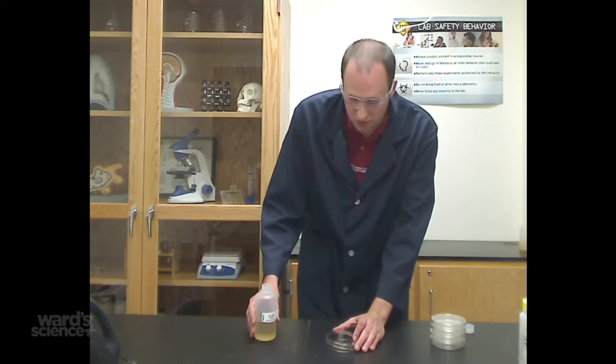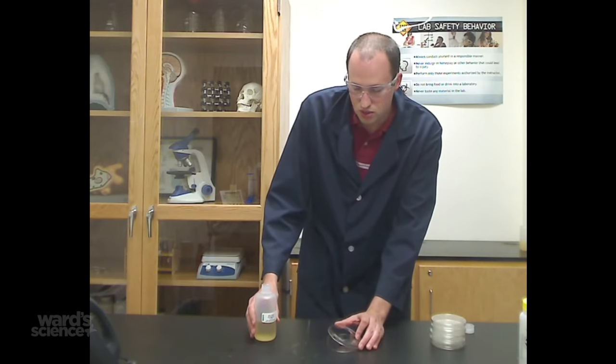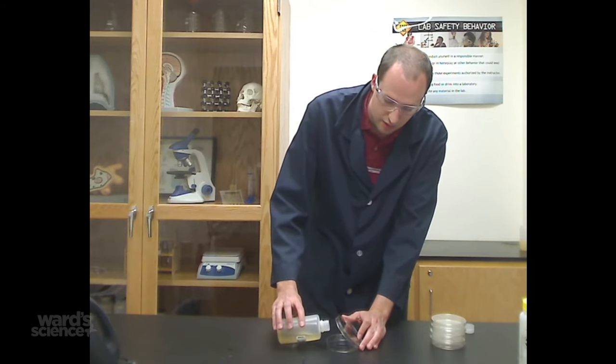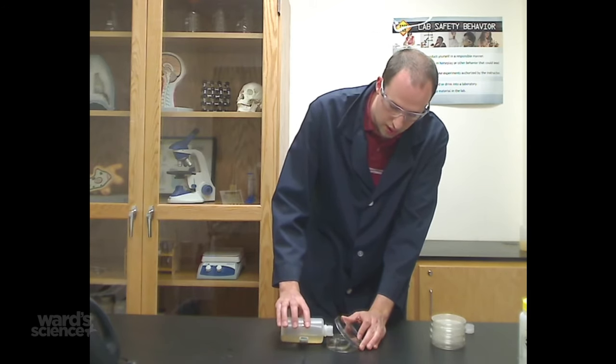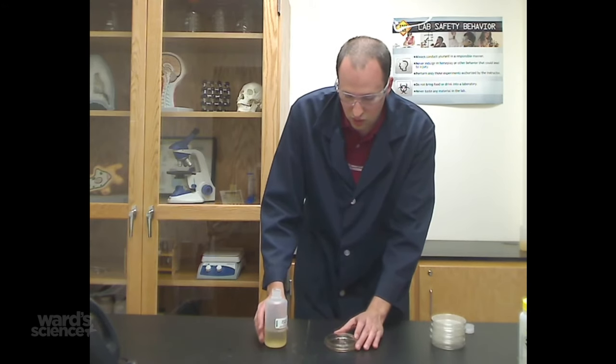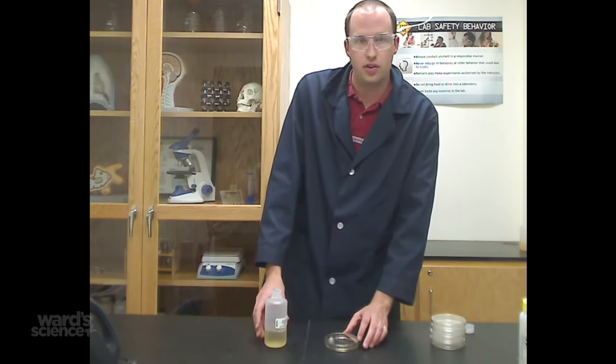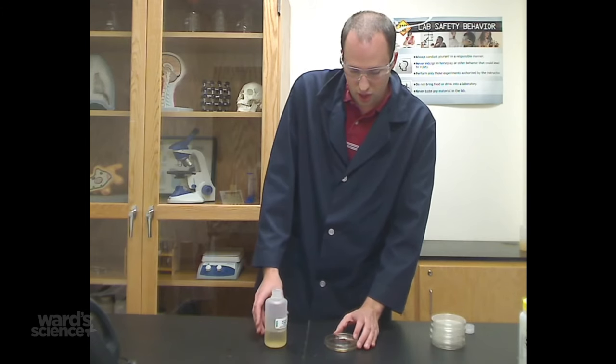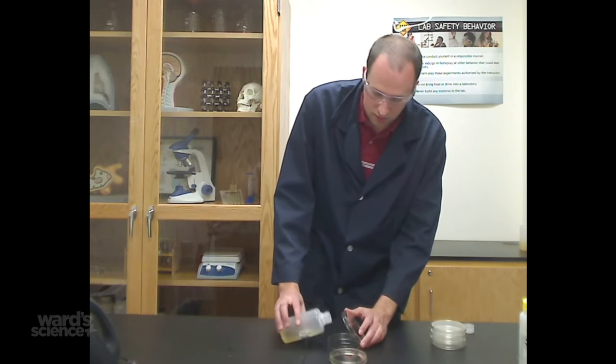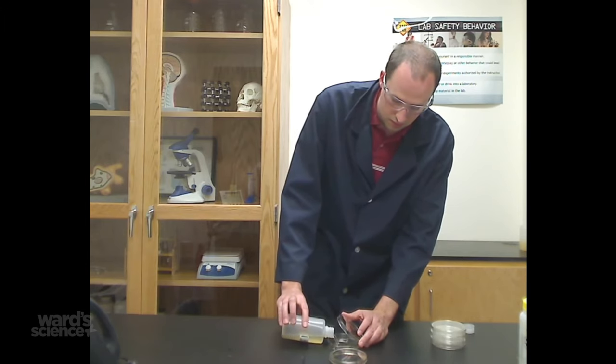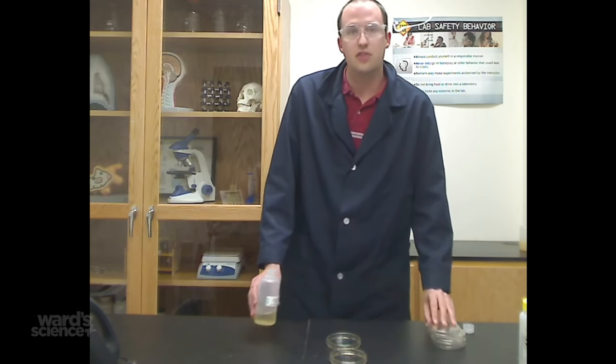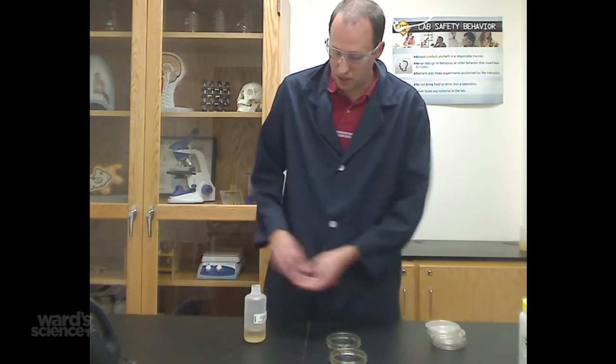To pour each plate, you just, with one hand, barely lift the top off of the Petri dish, pour it in, swirl it around to make sure that it has completely covered the surface of your plate, and set that to the side, and so forth, until the bottle is completely gone.